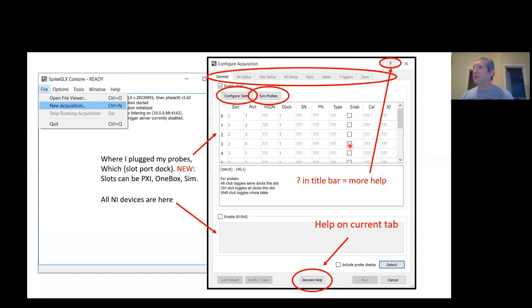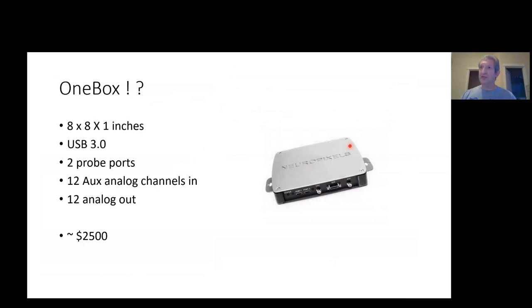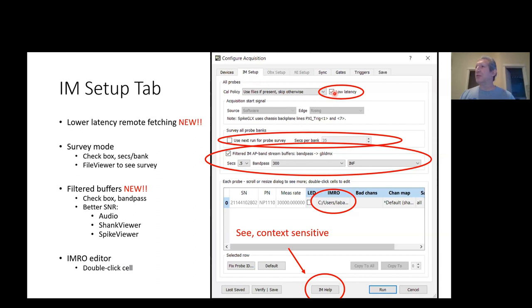Let's move on to some things on the next tab, which is the IM tab. There's a new checkbox here called Low Latency. Check this box when you're using remote SDKs to fetch data from SpikeGLX. You'll get that data coming into your remote program with somewhat lower latency. It costs a little bit more CPU cycles to do that, but that's probably worth it to you.